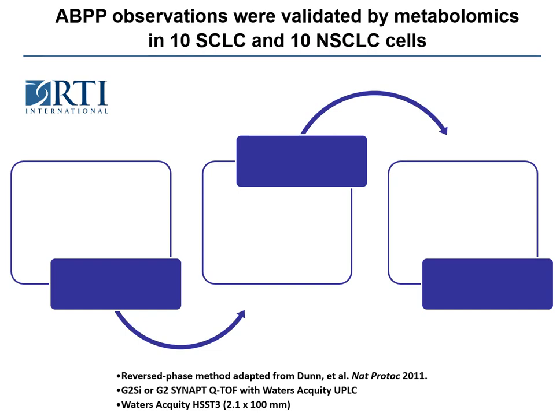The process is that the cell line extracts were analyzed by UPLC, QTOF, and MS in positive and negative ion mode, using reverse phase separation, and all the group differential metabolites were identified by two software. Sorry, this is not shown very well.